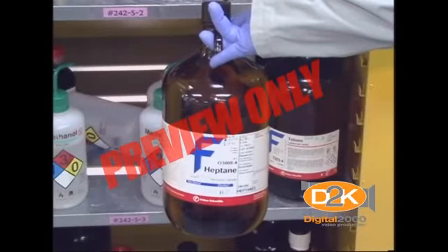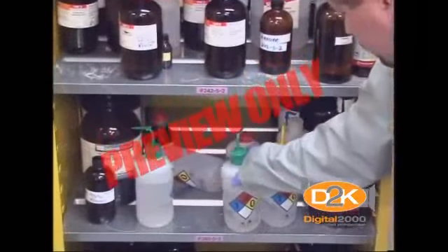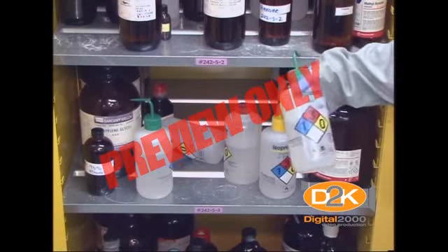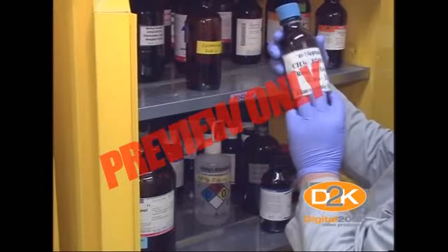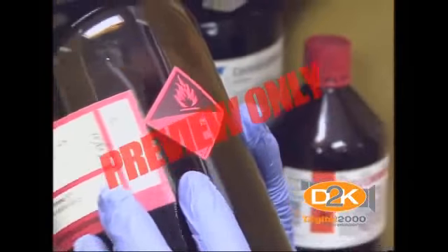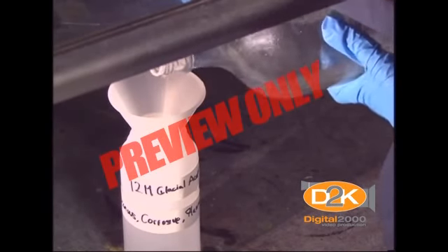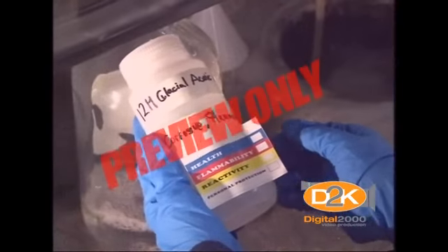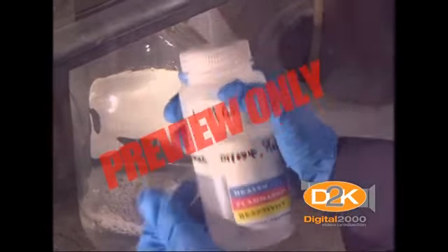The manufacturer's original container labels should be left on the containers and kept intact. When transferring a chemical from the original container into a secondary container, the secondary container must be labeled with the full name of the chemical product, if applicable, the full name of chemical constituents, with no abbreviations, acronyms, or chemical formulas, and chemical and physical hazard warnings. If an empty bottle is going to be reused, be sure the new contents are compatible with the original contents of the bottle. You must then remove or completely deface the old label so there is no confusion over the contents in the container.